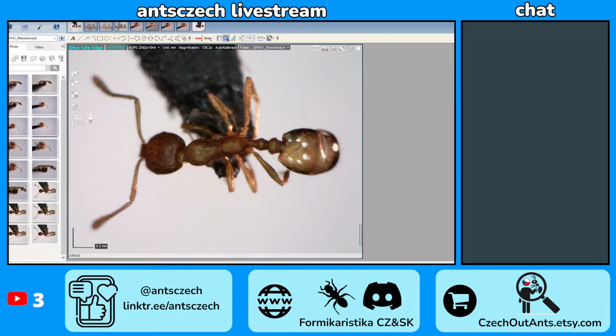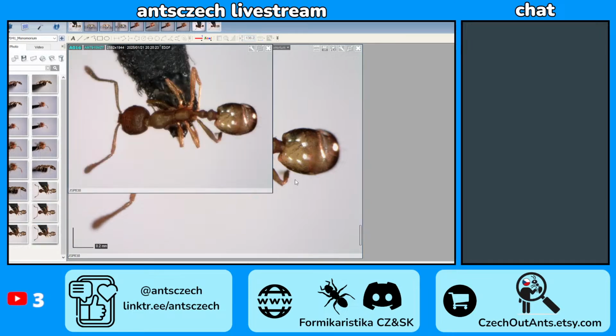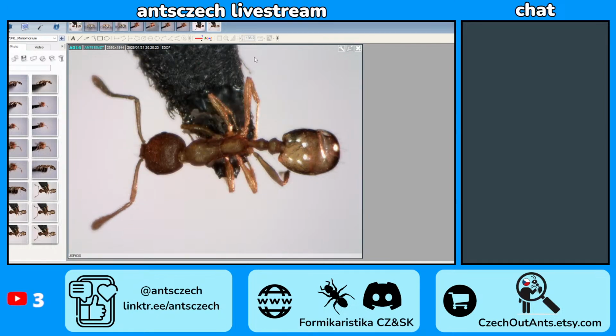Oh, I just noticed. I checked the specimen again because I tried to use water on it to get rid of the glue, which worked. But now I accidentally destroyed one of the legs, and one of the leg parts is still in the way. Which part did you destroy? The coxa. The coxa is still there, in the way.